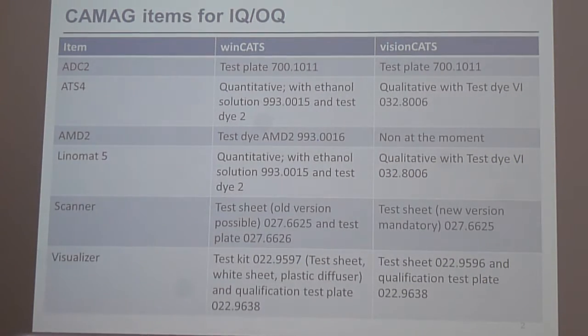What is also new, I put a date on it. The old one didn't have a date on it. If you want to have something with qualification, you should always have an expiration date, not only to make money.